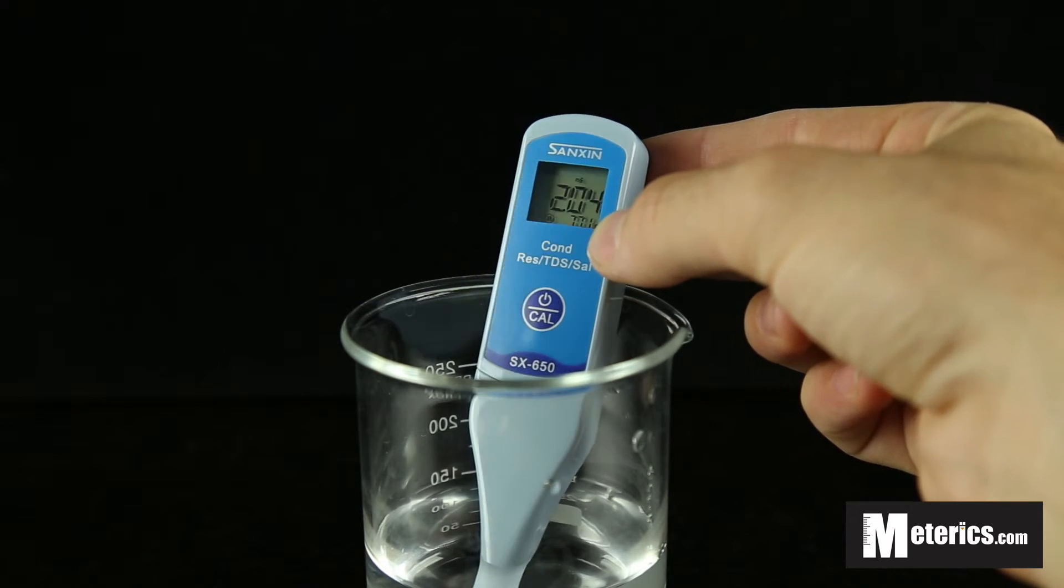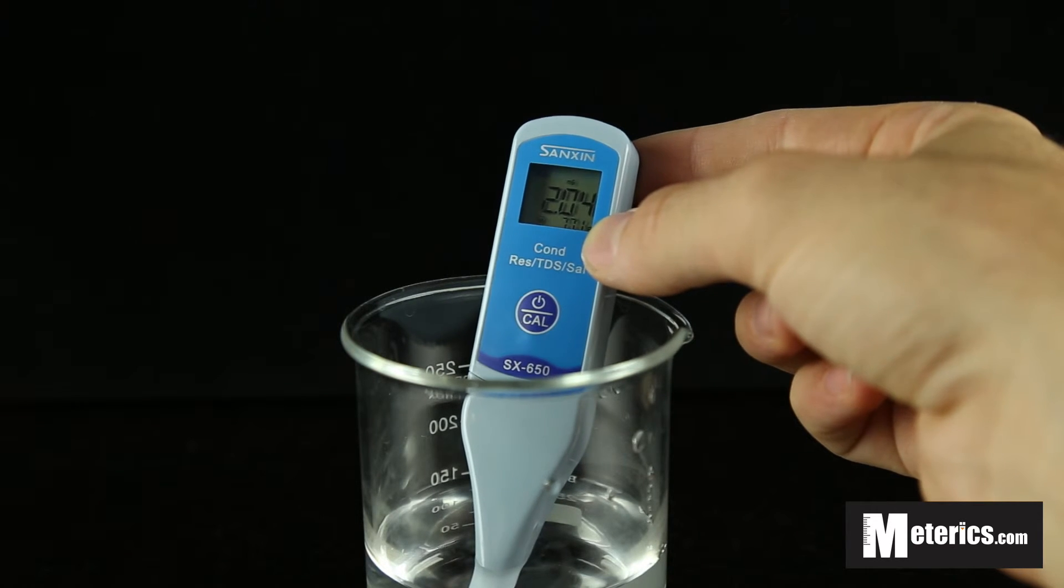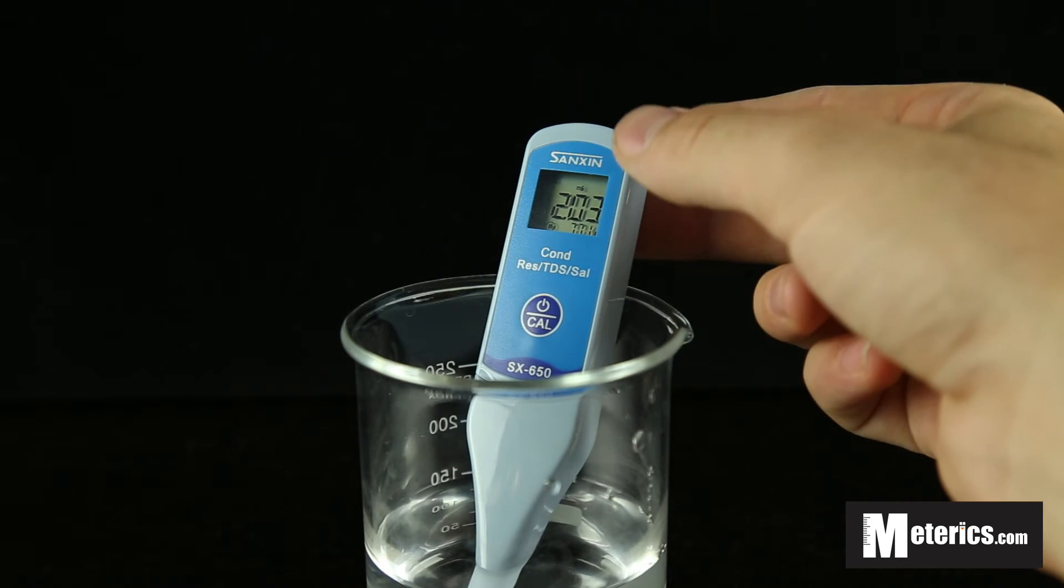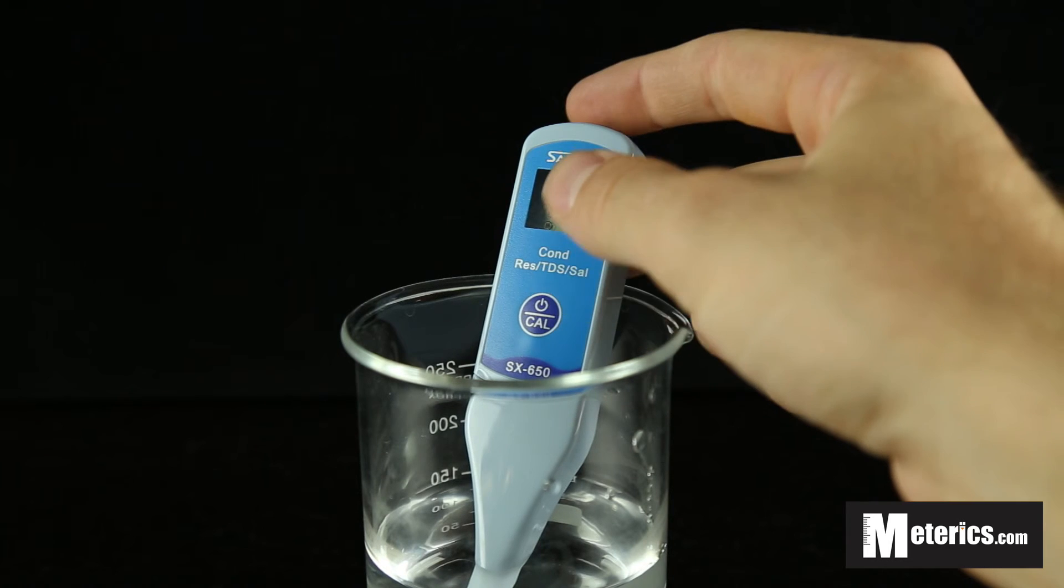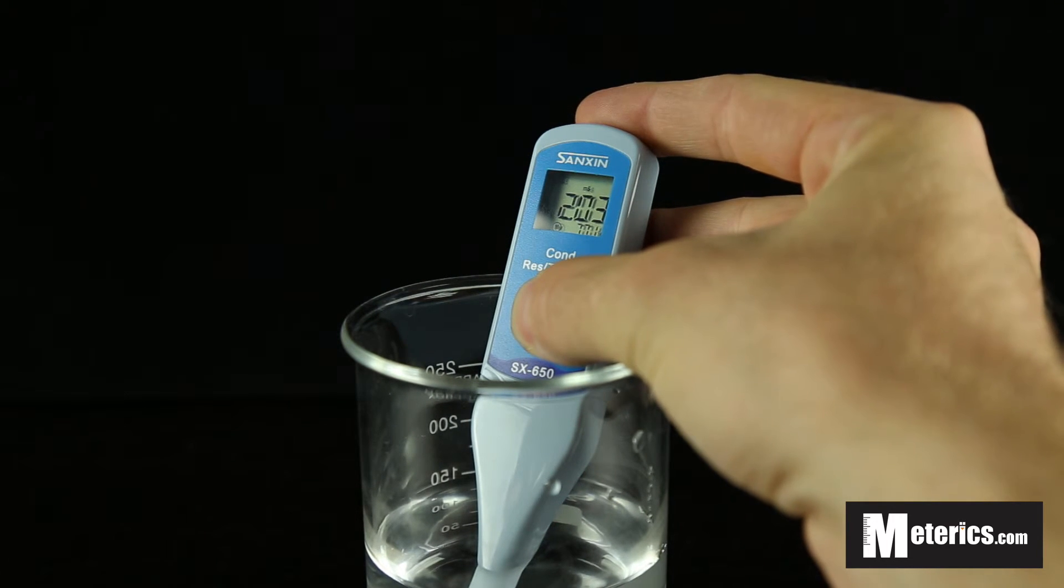You've got your temperature reading, so it will show readings in either Fahrenheit or Celsius, and this one button allows you to switch between the modes.